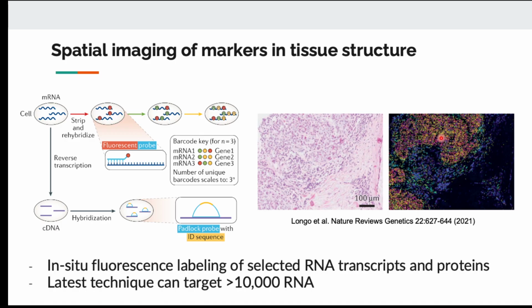The limitation in the past was that you don't have so many fluorescent dyes. You cannot tag so many proteins without starting to have the same color mapping to multiple proteins, multiple genes, or you have interference among fluorescent signals.